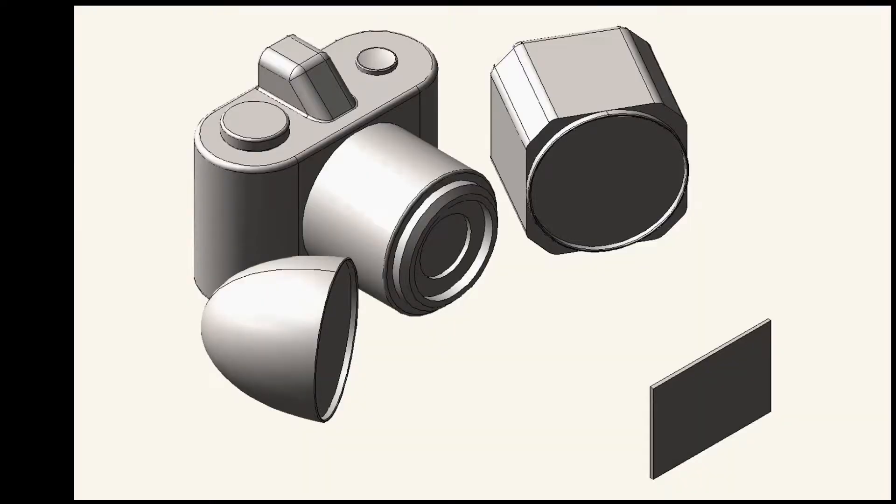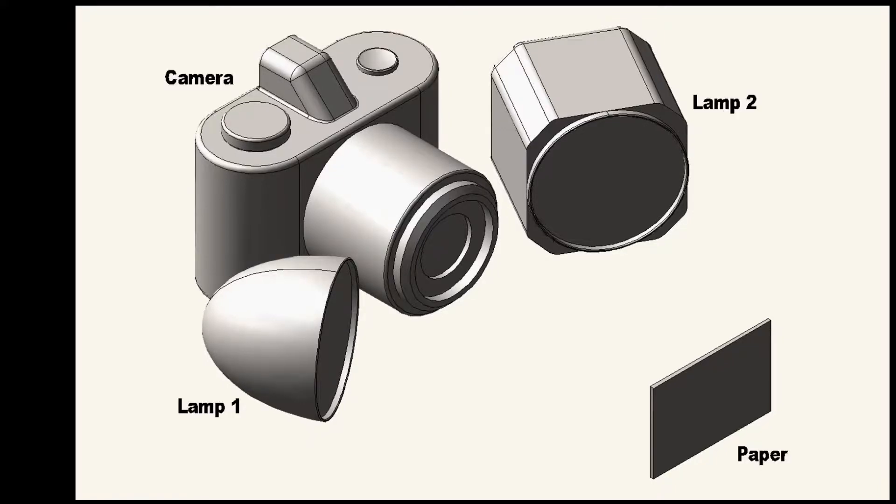I put together a setup using a camera, a support to hold samples of paper, and two lamps to illuminate the samples. I used an ordinary camera having no special lenses, filters, or sensor. Lamp one is an ordinary light available in any photography shop. Lamp two is a special light I built for this application. The paper holder kept each sample in the same position relative to the camera for either lamp.